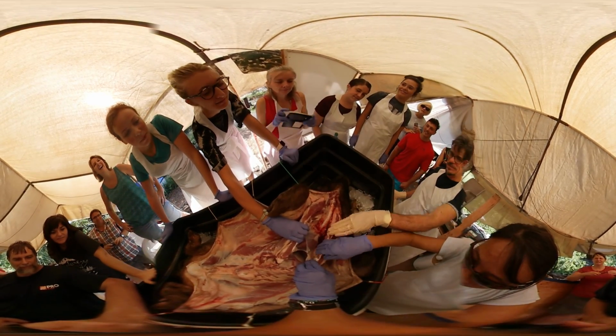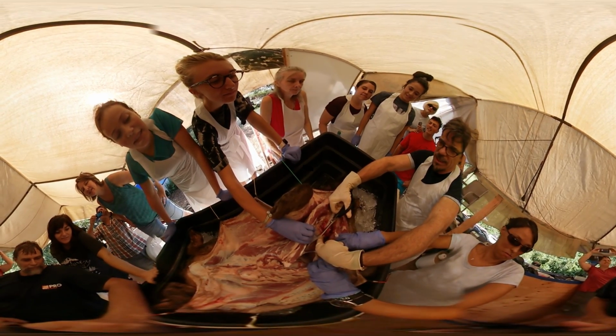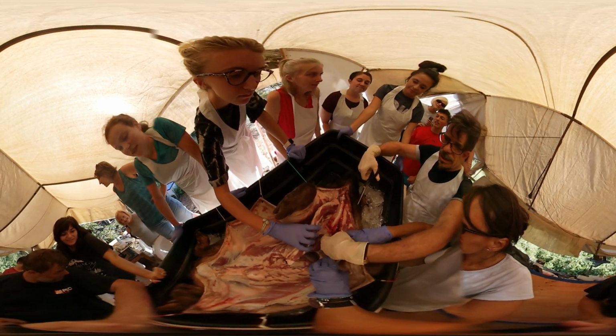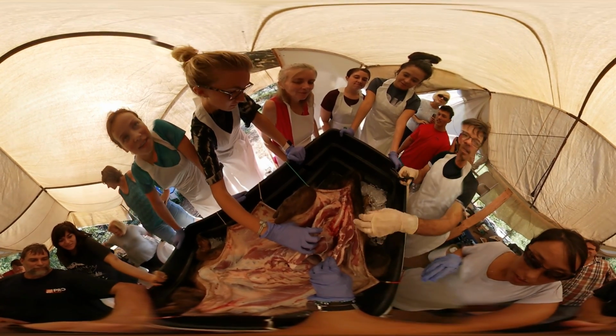All right, so now we're going down the respiratory system. Just going to take some of these membranes off. Oh my gosh, that's the heart.